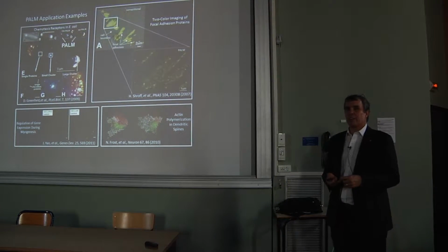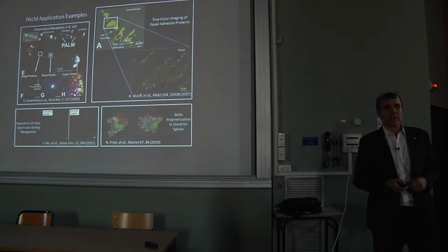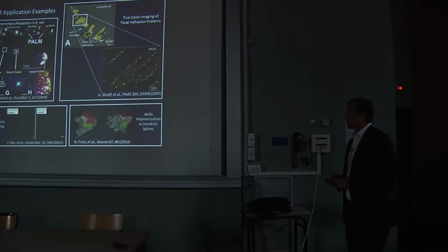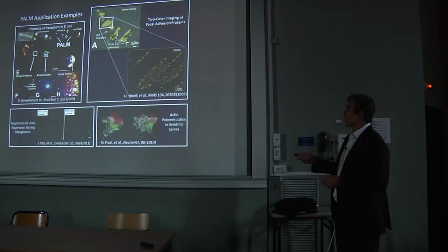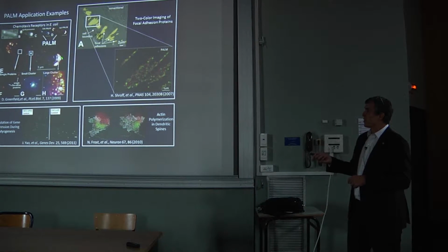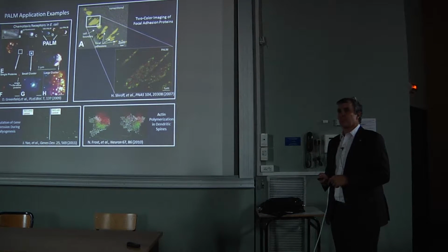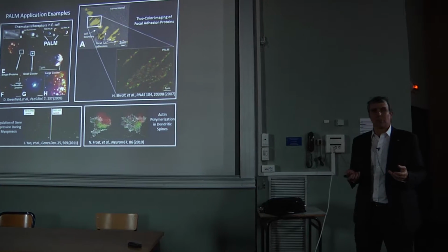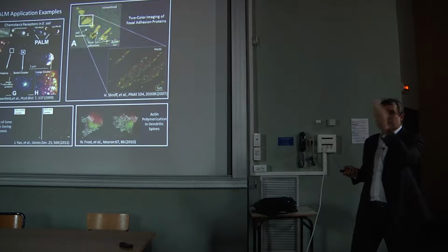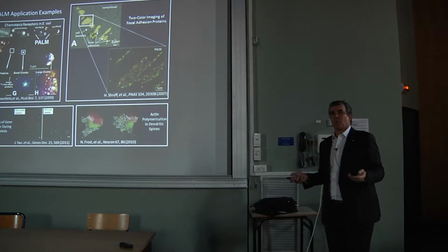So Harold and I, at the same time, both got jobs at the Janelia Research Campus of the Howard Hughes Medical Institute, which was modeled after Bell Labs. And so once we were there, we started to do applications of PALM. Here we were able to look at chemotaxis receptors in E. coli and show that there's a wide spectrum of cluster sizes. That spectrum is actually predictable in terms of a stochastic model of self-assembly, where the protein monomers are inserted into the membrane randomly, diffuse randomly until they stick, and the probability of sticking is just proportional to the existing size of a cluster.